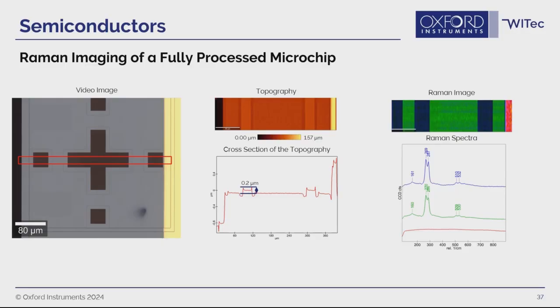In this case, you see this 200 nanometers difference compared to the noise level on a very flat region. A second task of this measurement was to look for contaminations on the contacts. In this case, we see the spectrum of gallium arsenide and no contaminations.